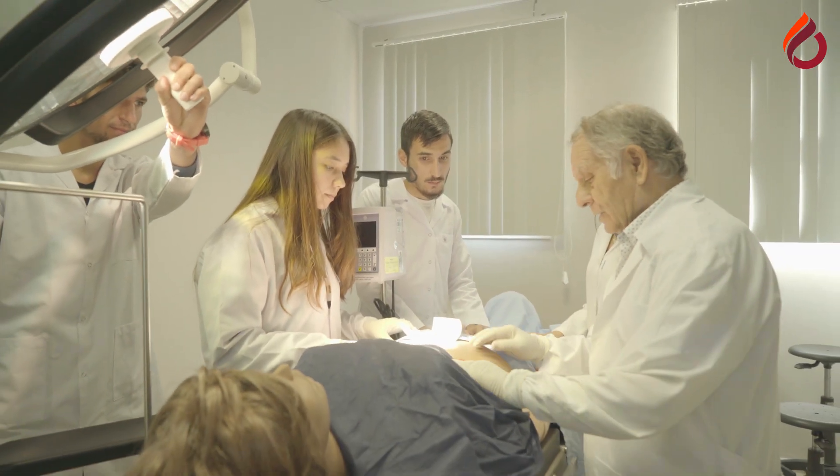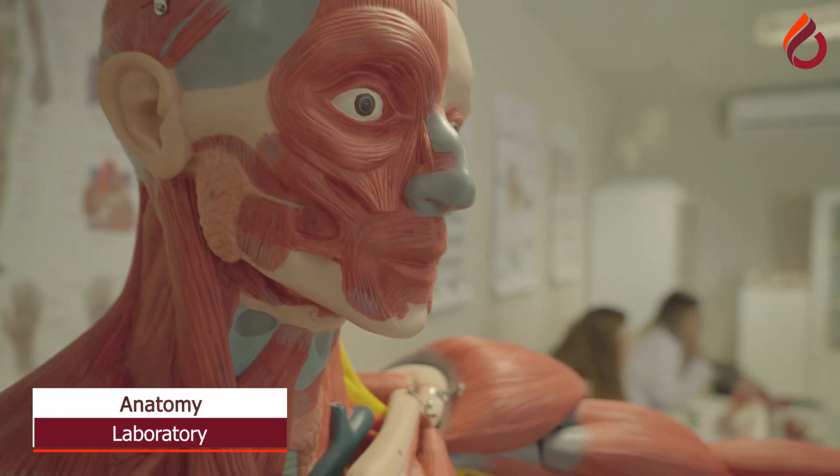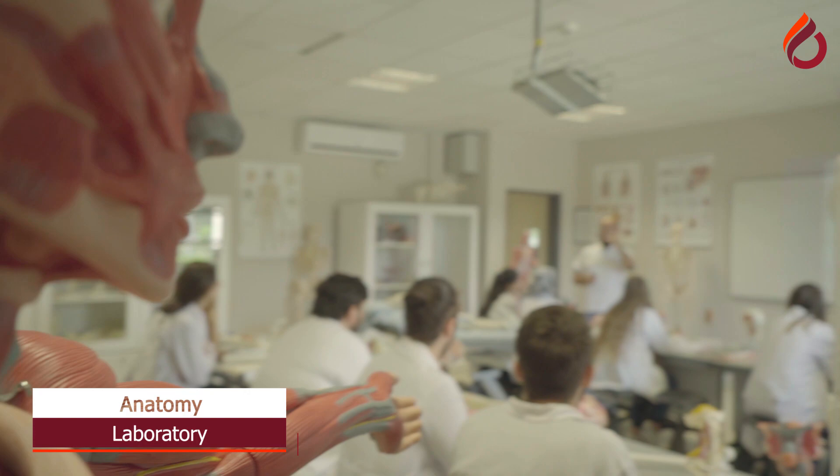The experience you gain in the international and interdisciplinary studies in the laboratories will help you succeed and make a difference in your future career.